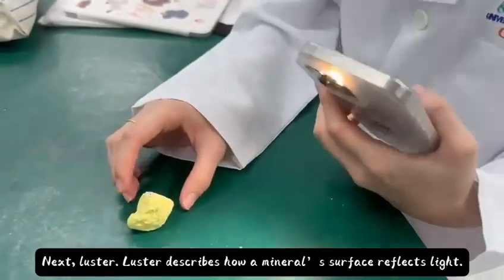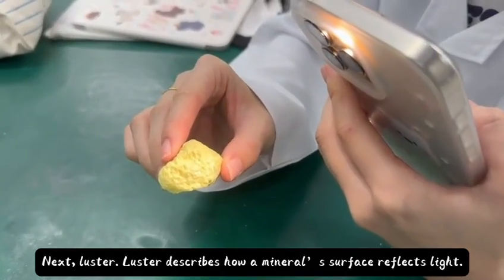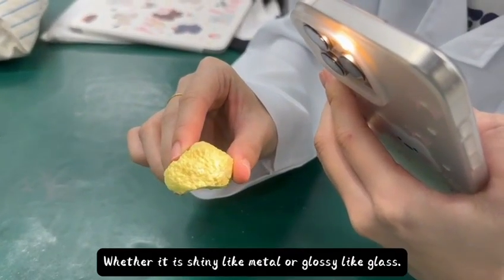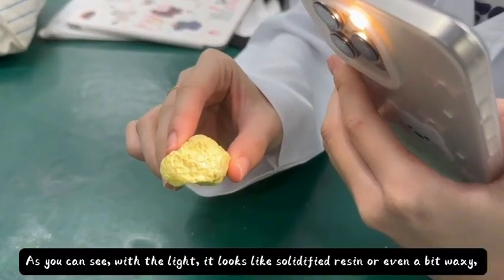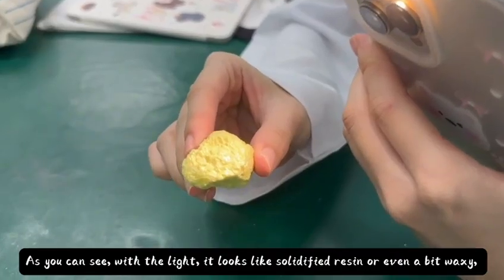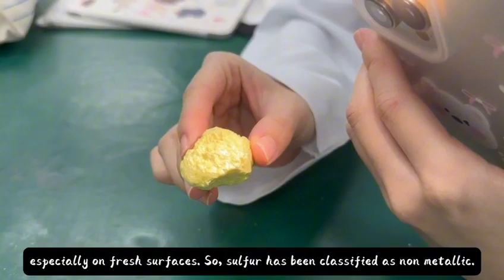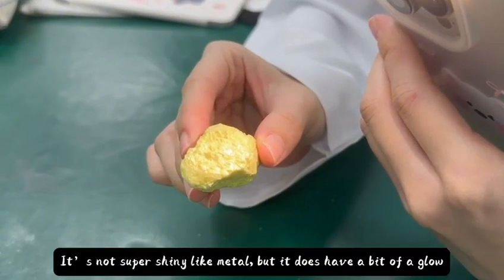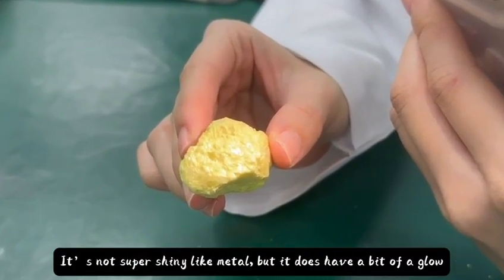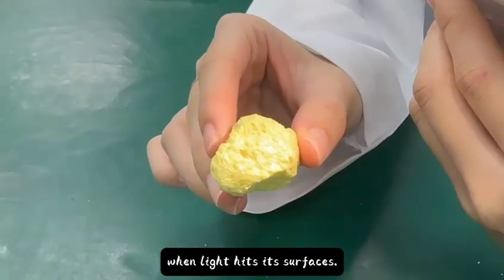Next, luster. Luster describes how a mineral surface reflects light, whether it is shiny like metal or glossy like glass. As you can see, with the light, it looks like solidified resin or even a bit waxy, especially on fresh surfaces, so sulfur has been classified as non-metallic. It's not super shiny like metal, but it does have a bit of glow when light hits its surface.